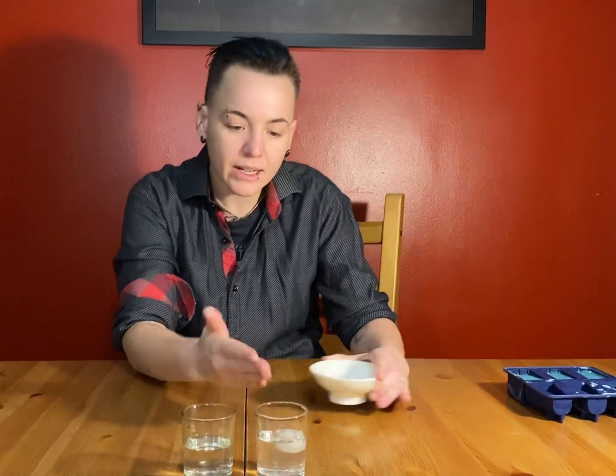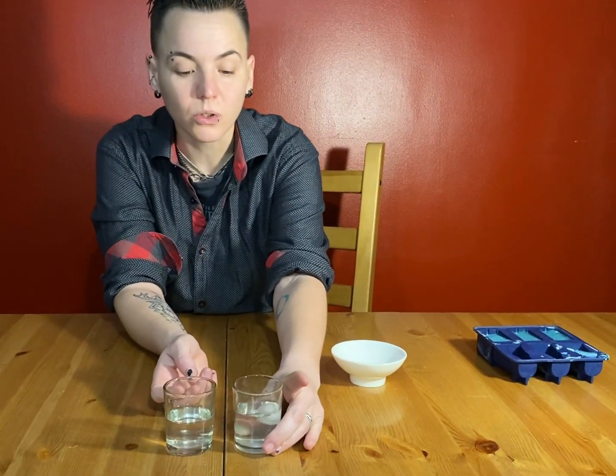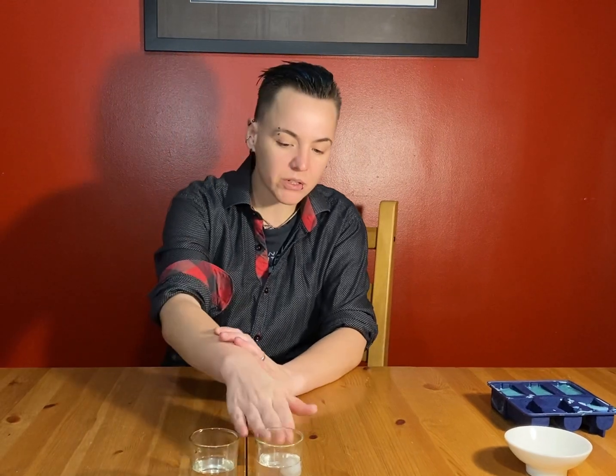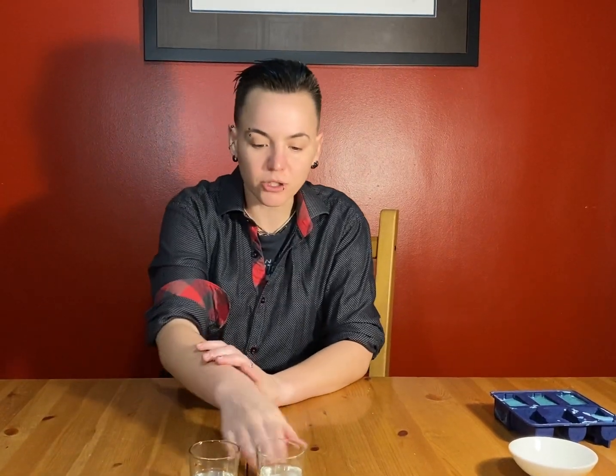Nothing's happening, right? We're not getting a color change. We're not getting a change in temperature. It's not becoming hotter or colder, except for maybe the fact that this ice cube is melting and giving off some cold to the vinegar, but that's not enough to create a chemical reaction. We're not getting a precipitate forming in here, so we're not getting solid chunks that are magically appearing in this. So no color change, no temperature change, no precipitate, and we're not getting gas bubbles, right? Those things are not happening.